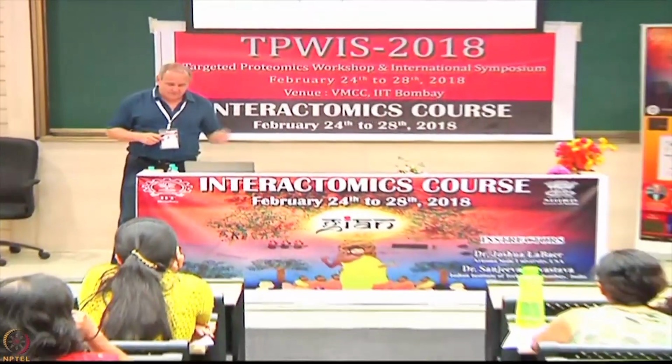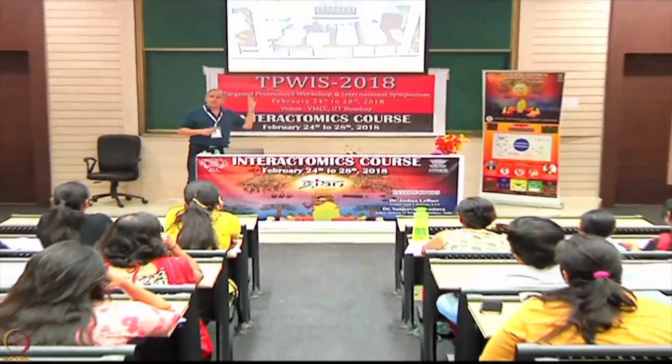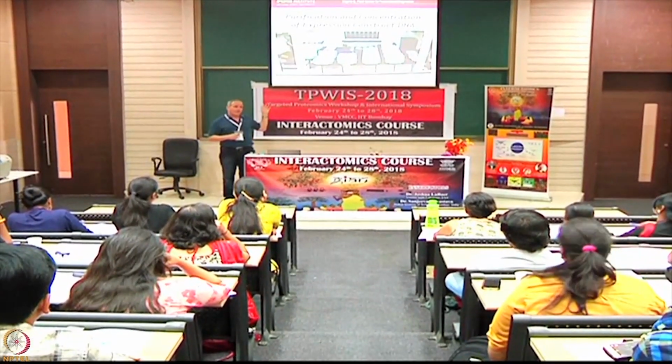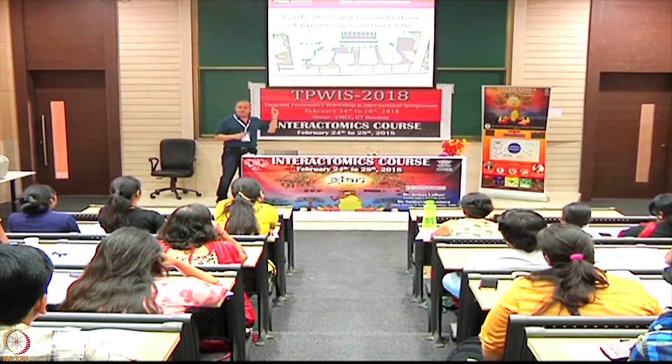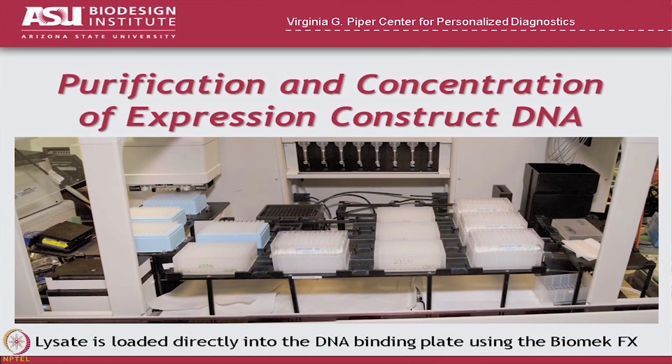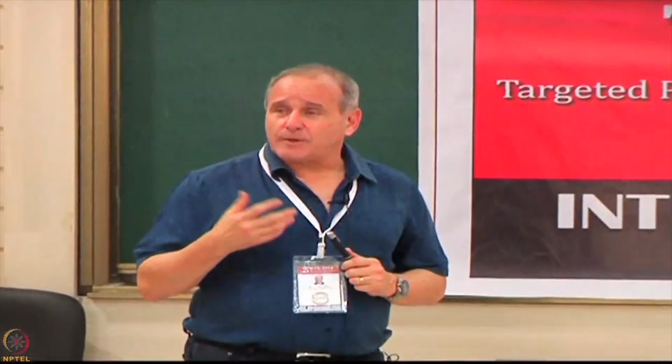So this is the method that we used to use to purify the DNA. Those of you who know Sanjiva, this is when he was in the lab, this is how he did it. This is an automated platform. We had worked out using a robot how to do DNA mini preps using robots. That allowed us to do, if you were really working hard, about 600 a day in a sort of team approach. That was not easy, but you could do it.